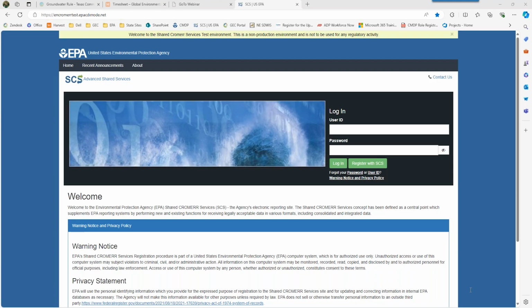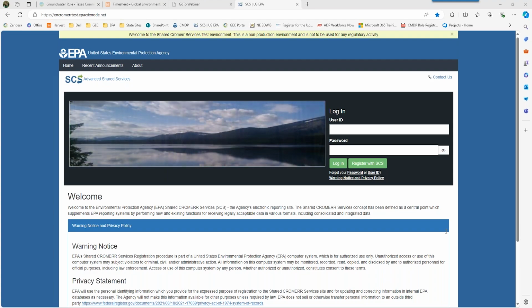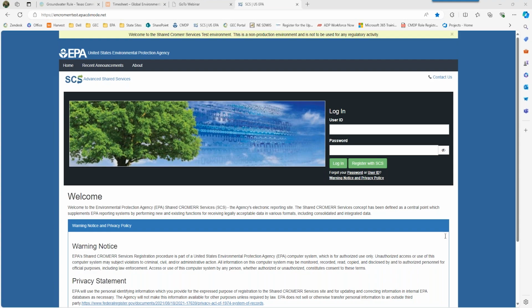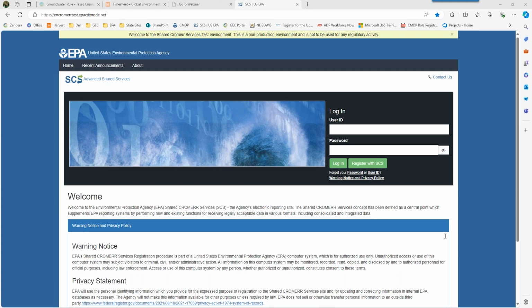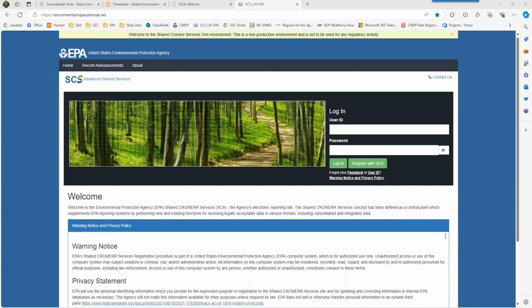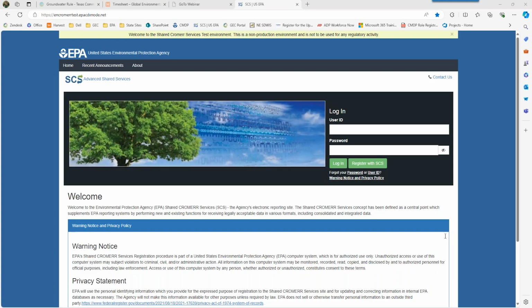All right, can we upload a CSV file to CMDP? Casey, do you want to answer that one? So no, there's no CSV file, but the Excel template generates an XML file. So it has to be an XML file that gets uploaded. Right. So if you are a lab that has a LIMS system and can export data to XML, you can do that as well. It just needs to be in a very specific XML schema format to be correct. And we can work with you all individually on that if you have questions.